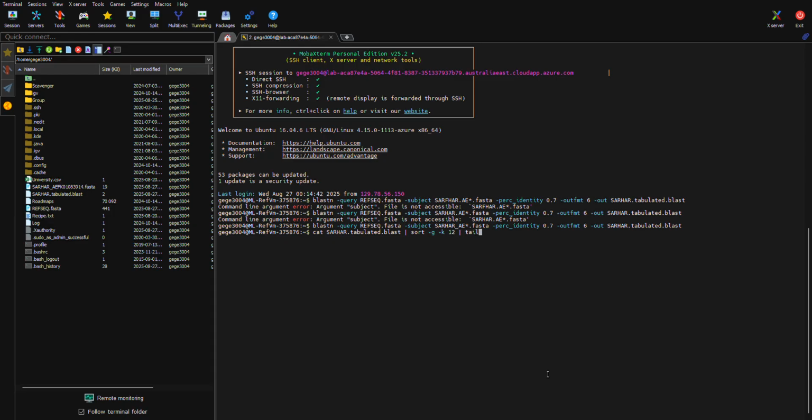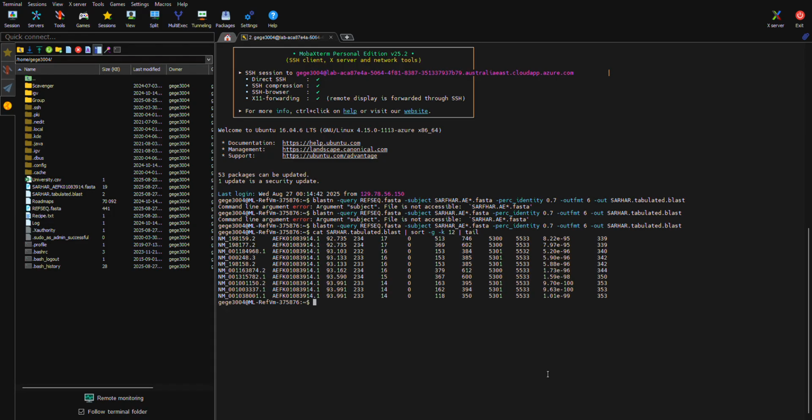Again, you have to type it out though, because if you cut and paste it, it will not work. Pipes pretty much break anytime you cut and paste them. When you do that, it should give you the last 10 lines. They should be sorted, and you should see the top, the score that you're looking for. How many have found that already?